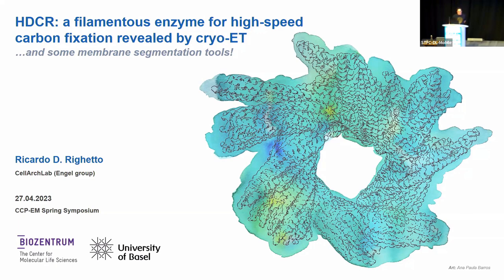And today I'll be talking about HDCR, which is a filamentous enzyme from bacteria that can do carbon fixation very efficiently, and how we use cryo-ET to study it. And towards the end of my talk, I will also show a little bit of some new membrane segmentation tools that we are developing in the group.